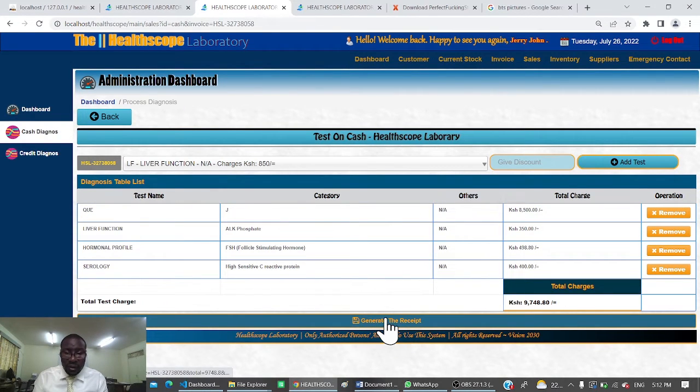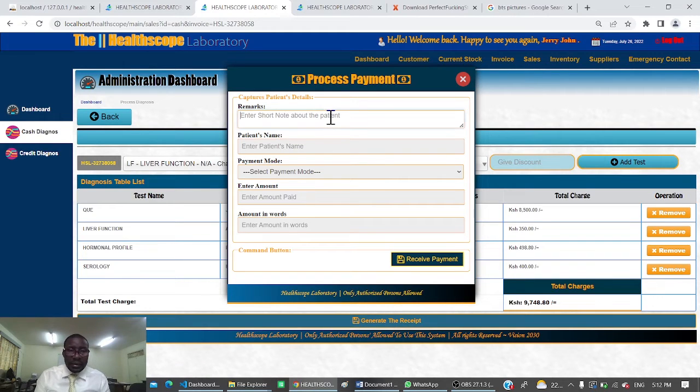You just click on this one, like that, and then you have remarks, you have patient name, you have payment mode and everything. So here we can maybe say something like, the patient will be coming every month for checkup.